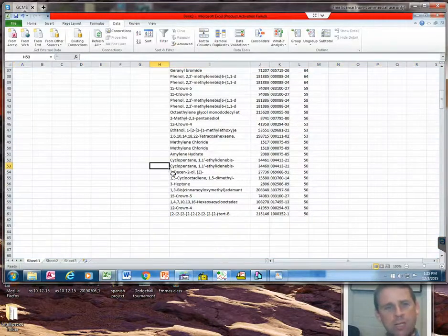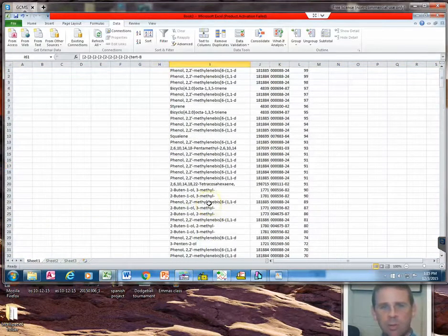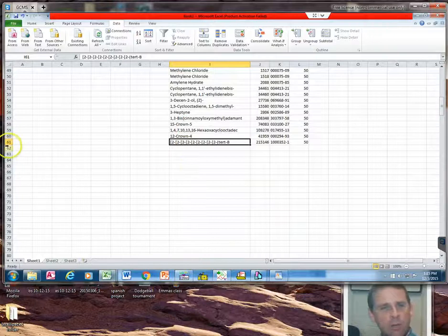So then I have a nice number of 61 chemicals that I have to deal with here. Does that make sense? 61 chemicals that have a qual factor of 50 or above. How do you know it's 61? Oh, because I just saw this number over here. Yeah. Side, right.